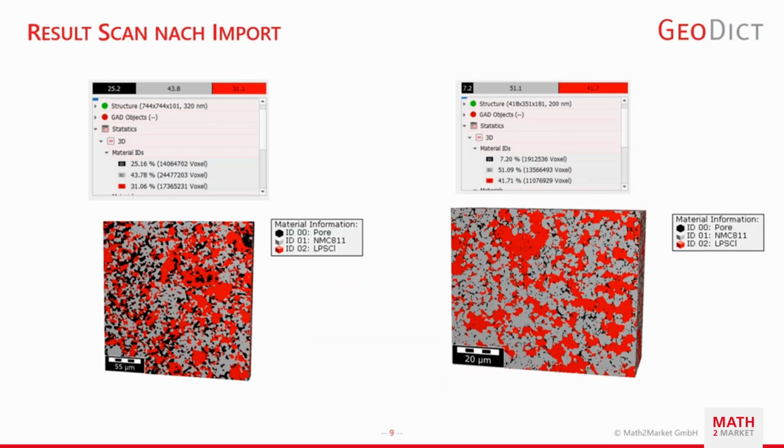So here I have two images. This is the powder one that I just showed you, which has still about 25% of void space or empty air inside of the structure, which is of course not what we want to have. So fortunately, I had a FIBSEM scan of an all-solid-state battery from the same group in Gießen, and this one was a compressed structure, so we see 7.2%. This is much more what we would aim for, but I'm fairly confident that with the compressed structure and the micro CT scan, we will actually be going towards the same boundaries in this case.